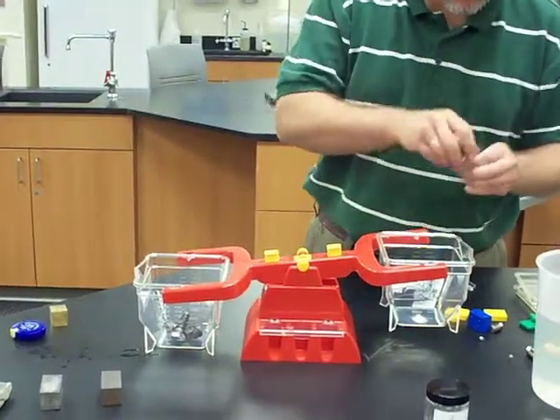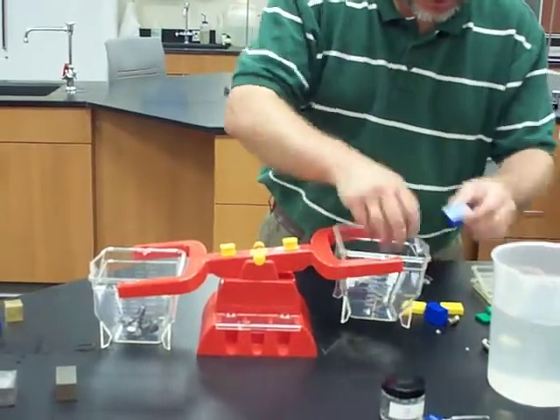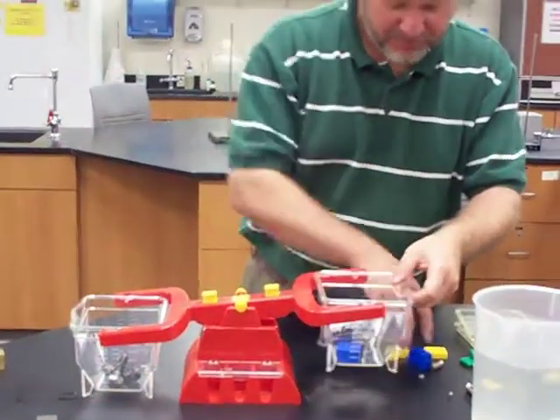Okay, I'm going to start with the 50. And that's 70 together.